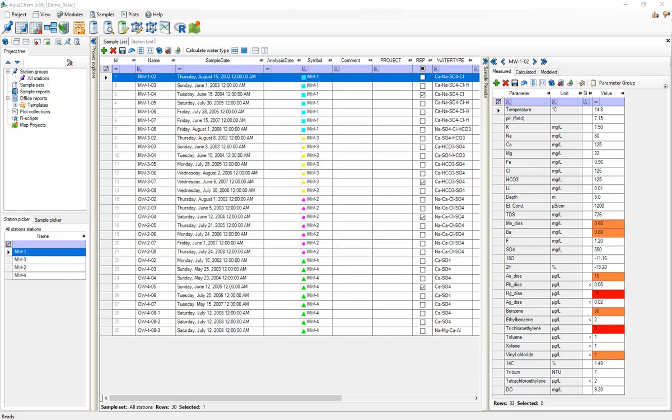Now that we've pointed AquaChem to the location of PHREEQC.exe, the next step to setting up PHREEQC for this project is to select at least one thermodynamic database. As I said this is supposed to be a short quick start guide. I don't really have the time to get into the nuances of what these thermodynamic databases are.